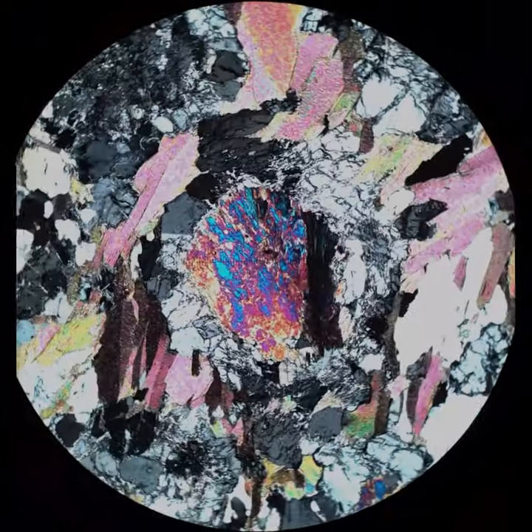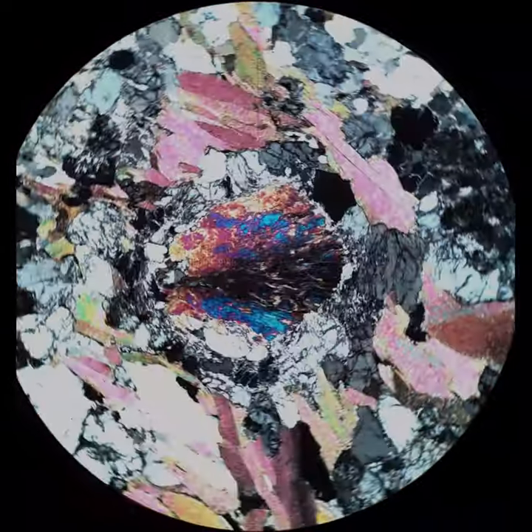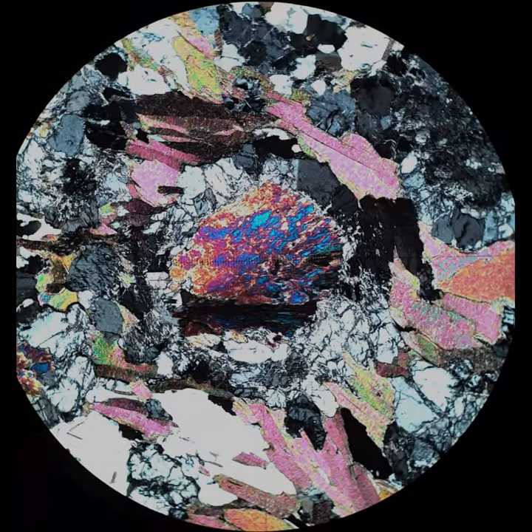How do you tell it from quartz? There are two different ways: one is to look at alteration, and another is to look at pleochroic halos. First I'm going to show you the alteration, then the halos.